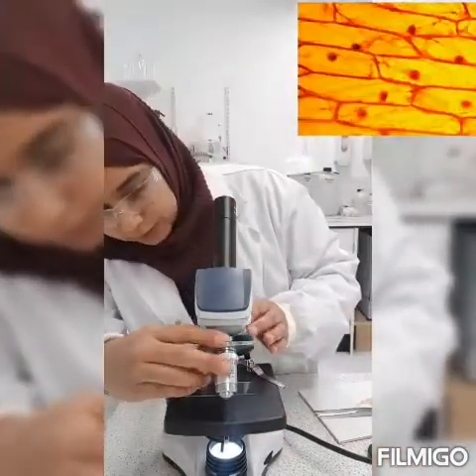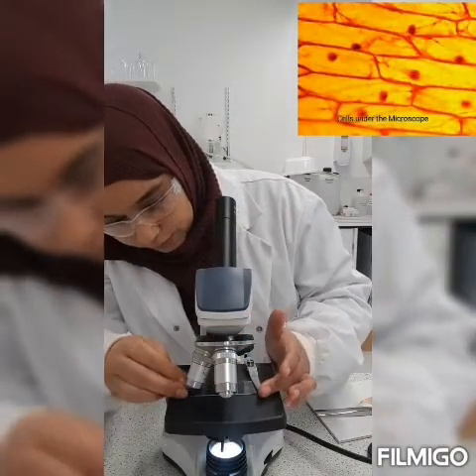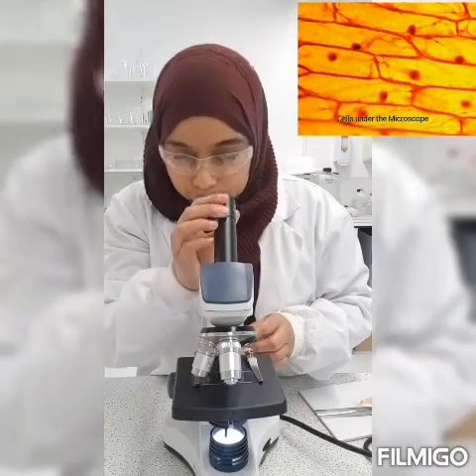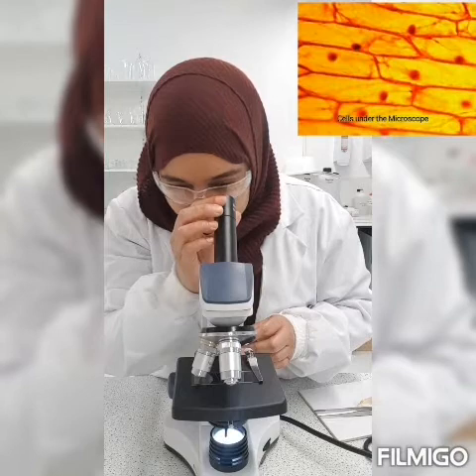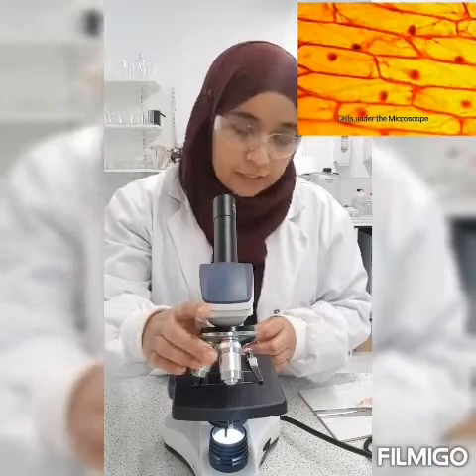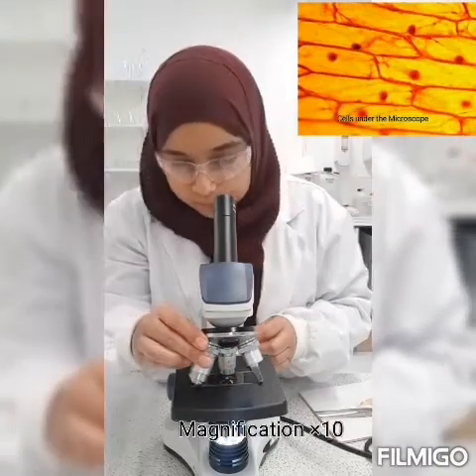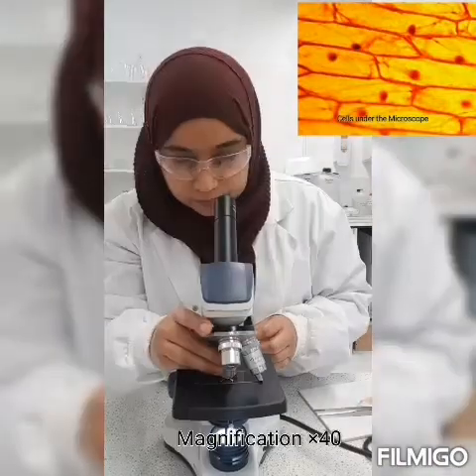And start with the lowest magnification, which is 4. And remember that the eyepiece also has a magnification of 10. Therefore, I'm looking at the cells at 40 magnification. Okay, I can see it very clearly. If you want to look at it more clearly, you can change your objective lenses to more powerful ones. So this is the times 10. And this is the times 40.